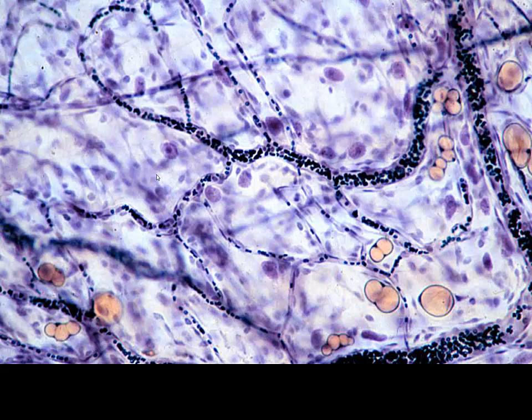Here again we can see a nice colored image. It's fairly easy to pick out the adipocytes, unilocular adipocytes, and we can see different sizes of these blood vessels. We can't make out any other histological structures and features, but you can clearly see the red blood cells in single file fashion. So this is either going to be a capillary, or possibly a venule. We would need to look at the histology of those vessels to be able to determine that.